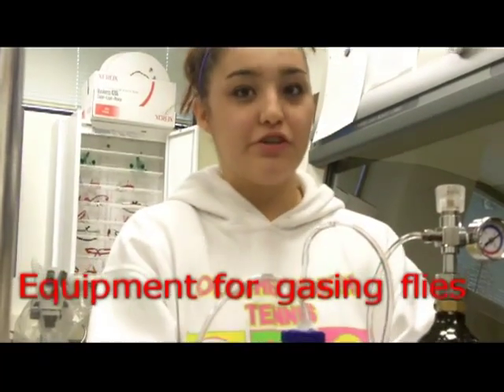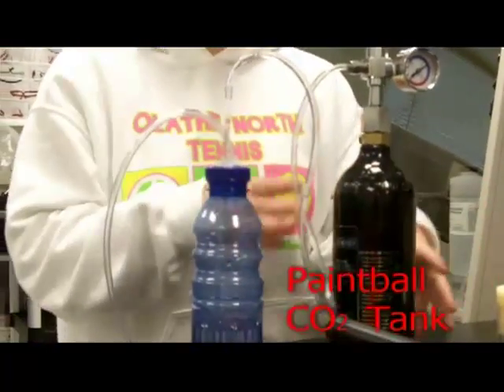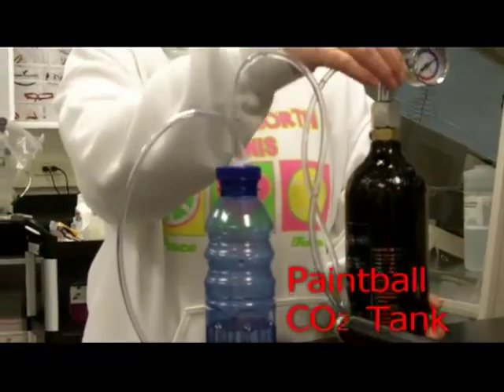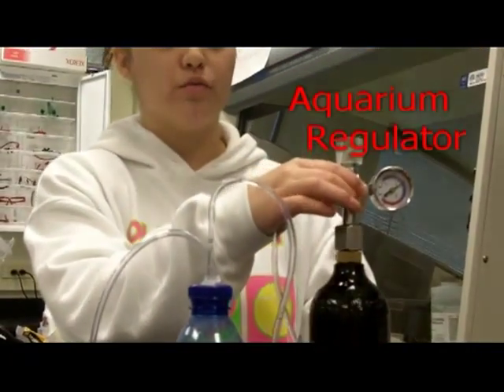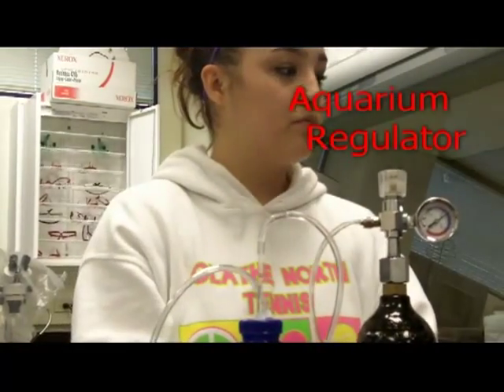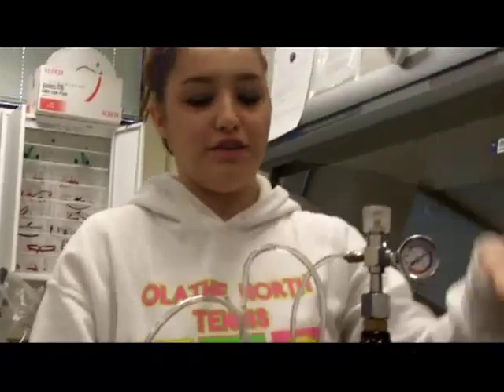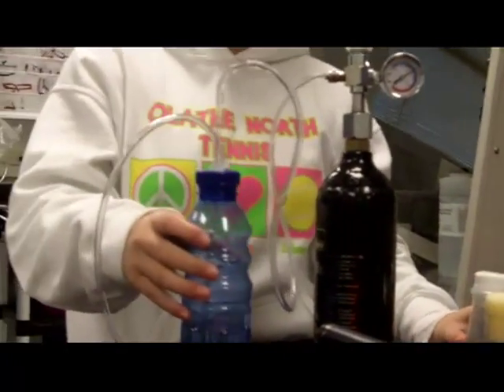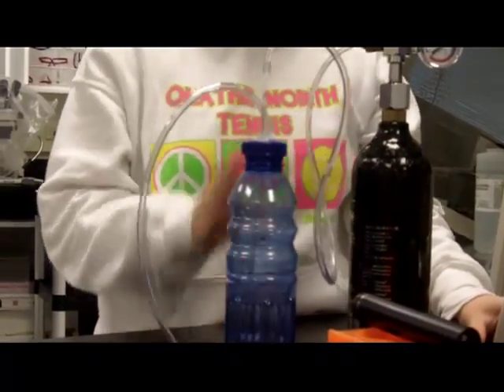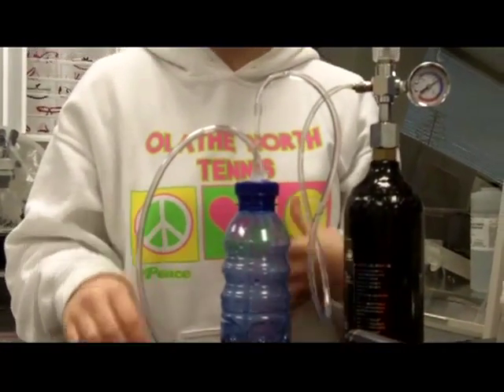This is an easy way to transfer your fruit flies. You're going to need a CO2 tank, which you can get from Dick's Sporting Goods for paintball. And then you're going to need a CO2 regulator, which lets you know how much CO2 you're putting into your little container. Then you want to have a little water bottle filled with some water, so you can have a visual to see how much you're really putting into it.